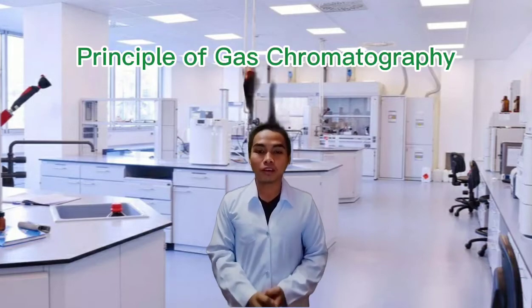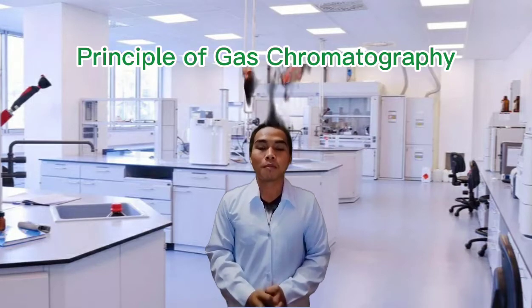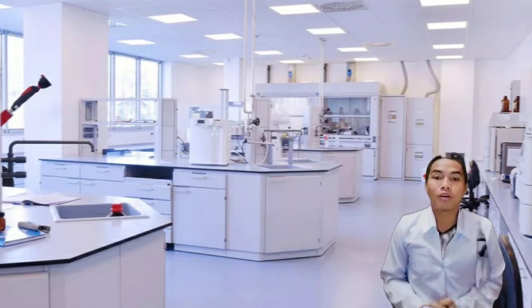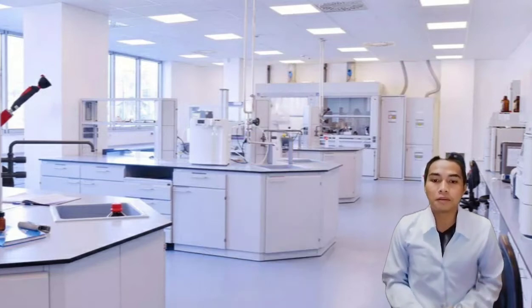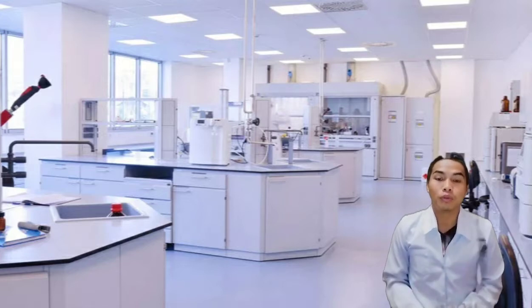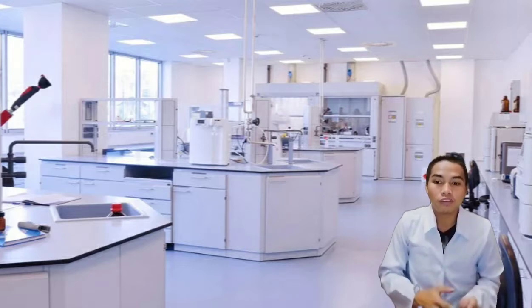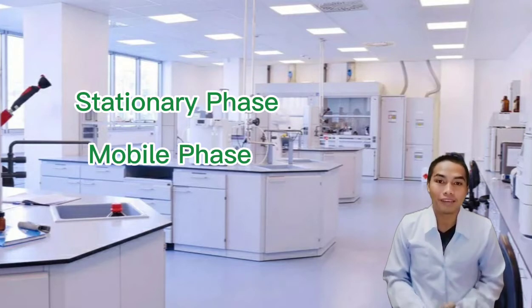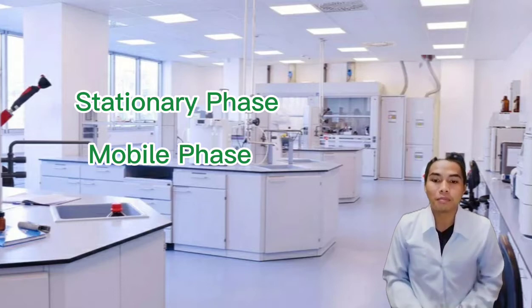Good day everyone, my name is Michael and today we are going to discuss the principle and application of gas chromatography. The principle of gas chromatography: components in the mixture are distributed between two phases, one of which is the stationary phase and the other is the mobile phase gas or carrier gas that carries the mixture through the stationary phase.